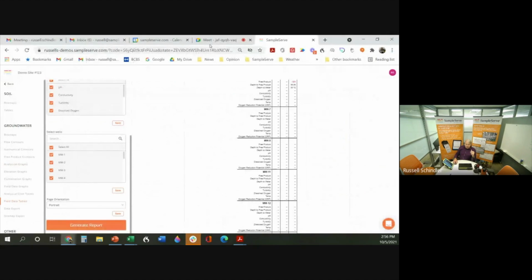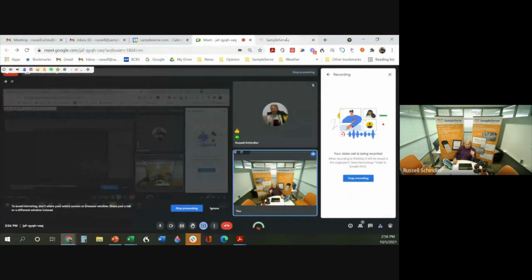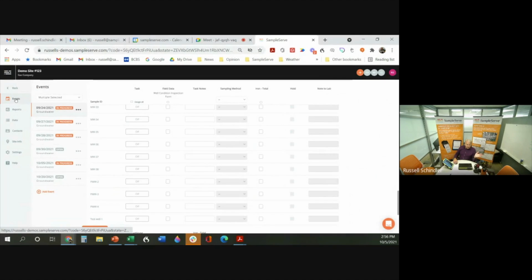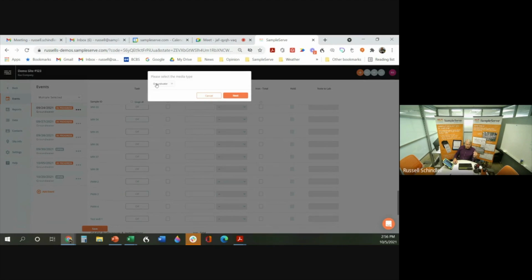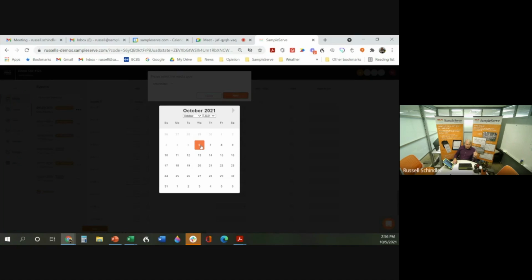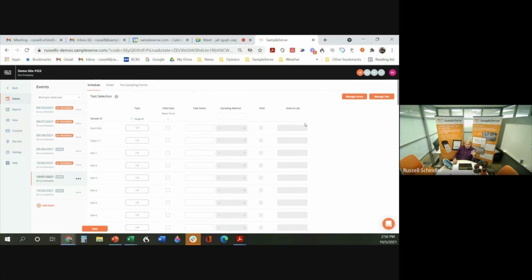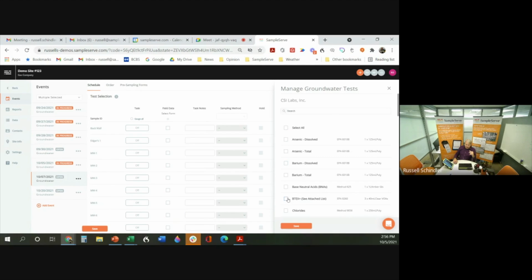All right, let me switch to now the field app. Well, actually, let me go to this last tab over here. We're now in events. I'm going to create a new event. I'm just going to say add a new event. I'll keep it a groundwater event. I'm going to do it on October 7th. So you'll see October 7th here. I click on that date. I haven't tested anything yet. I can actually pick what I want to test for. Let's just say BTEX.